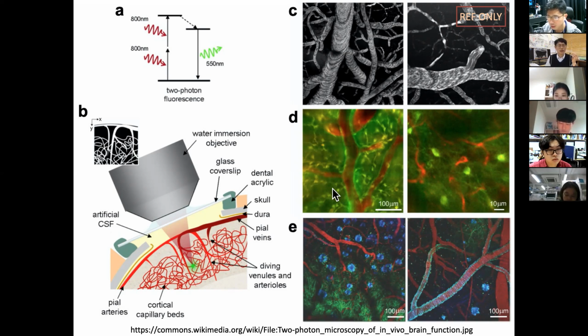We can actually give a calcium indicator to neurons, so that neuron will show green fluorescence and they actually blink, because neuronal activity comes with this calcium ion flux or changes, so that you can dynamically see this. And this is an example of specific dyes which show the neuronal structure and surrounding blood vessels.